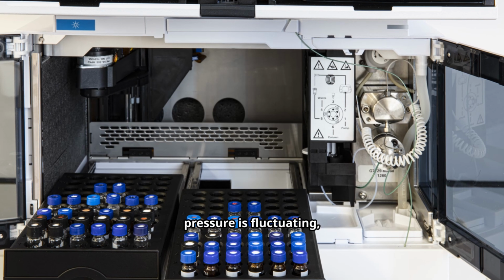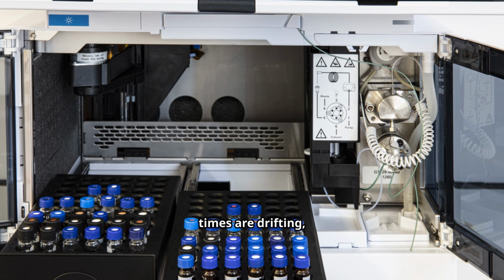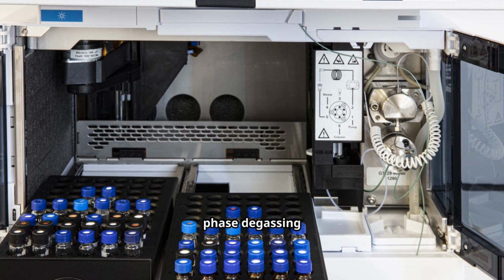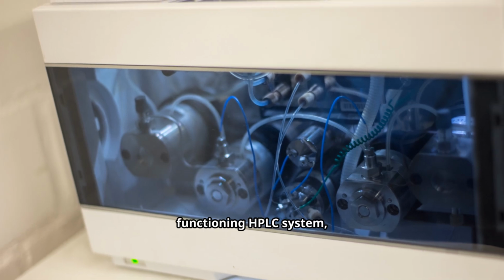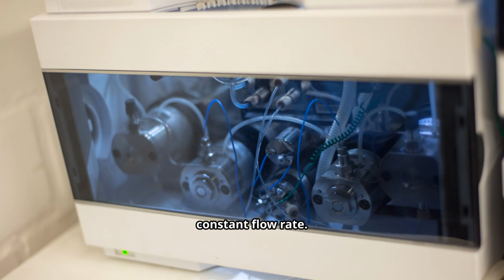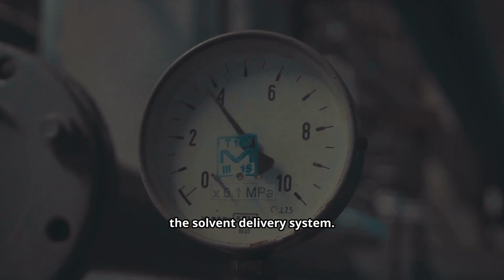If your HPLC pressure is fluctuating, your baseline is noisy, or your retention times are drifting, the cause is very often poor mobile phase degassing rather than a column problem. In a properly functioning HPLC system, pressure should remain stable at a constant flow rate. When you observe pressure ripple, oscillation, or sudden drops, especially together with baseline instability, it usually indicates that air is entering the solvent delivery system.